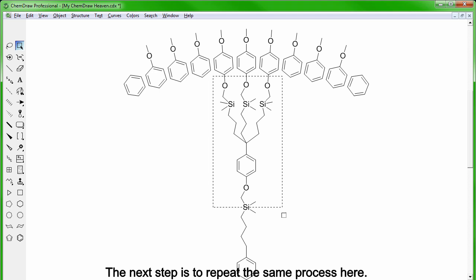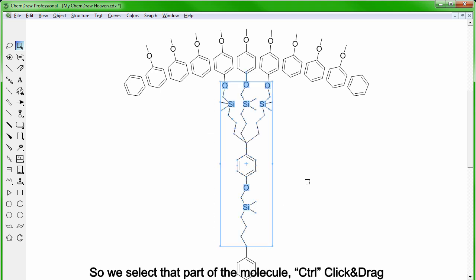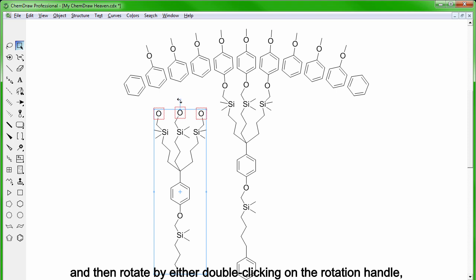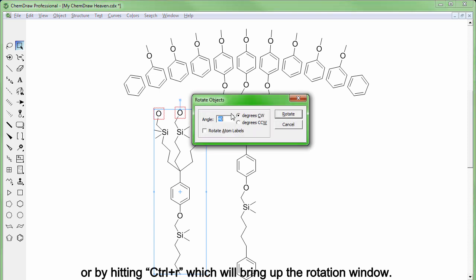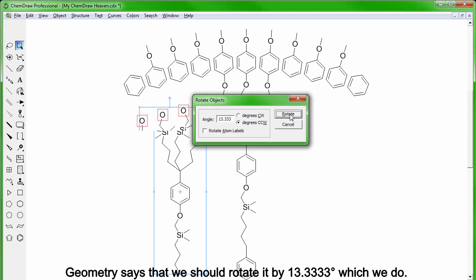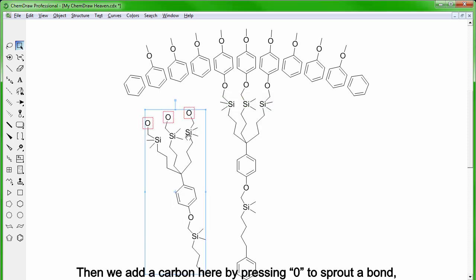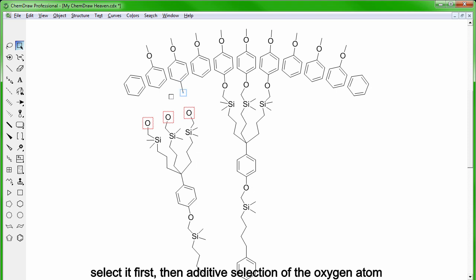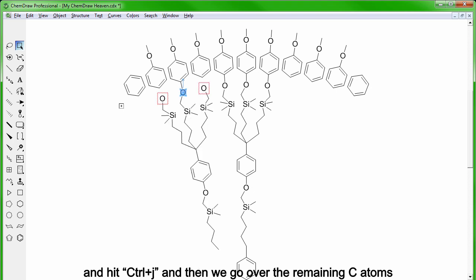Next step is to repeat the same process so we select that part of the molecule, CTRL, click and drag and then rotate by either double clicking on the rotation handle or hitting CTRL-R to bring up the rotation window. Geometry says that we should rotate it by 13.3333 degrees which we do and then we add a carbon here by pressing 0 to sprout a bond, select it first, then additive selection of the oxygen and hit CTRL-J.